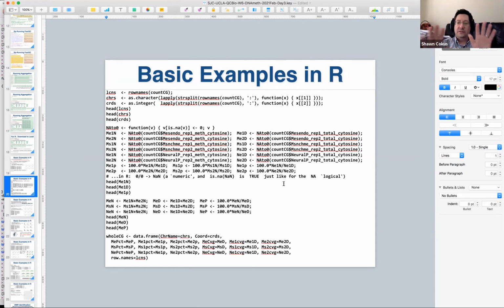The other way just averages the percent. What I generally would recommend, I think it works out best usually in practice, is that at the site level, it's okay to merge numerators and denominators, and it's probably what you want. When you compare different sites, you generally don't want to do that. You really want to turn each site into a percent and then average over those, because then each site gets equal weighting. And if you have some guy in there that's got really high repeat coverage or something, he expands, and he'll take over, right?